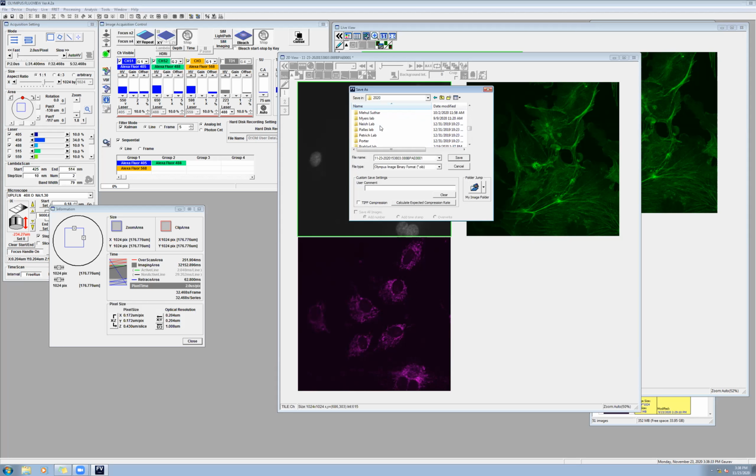Go down to Water Lab, and I'll create a folder for your name. And I would save the image over here, hello world. That's how people like to call the first thing nowadays.